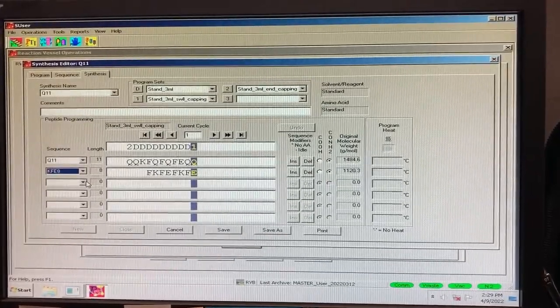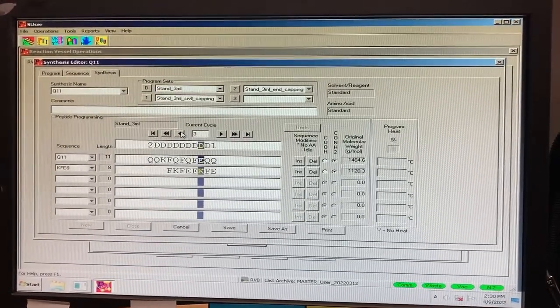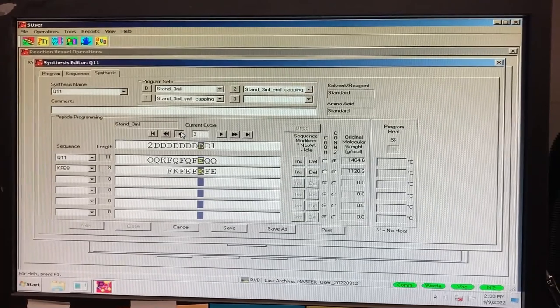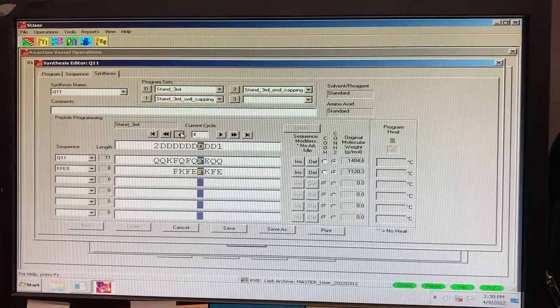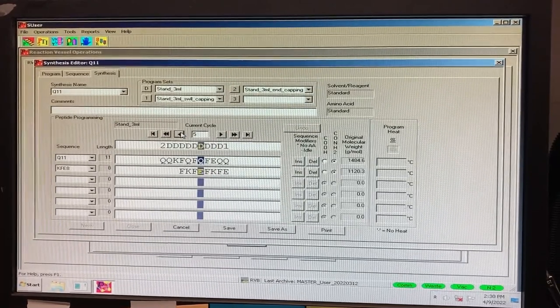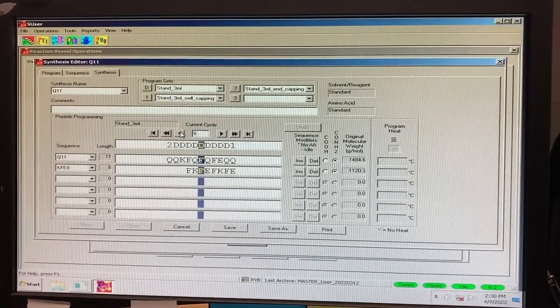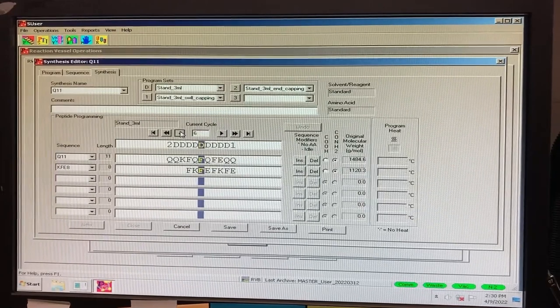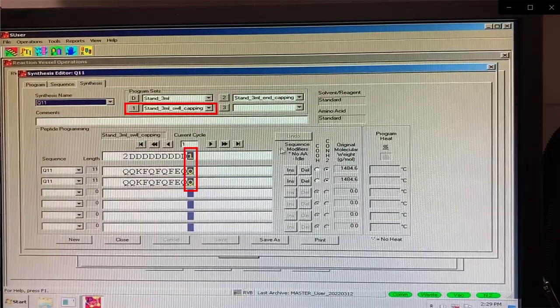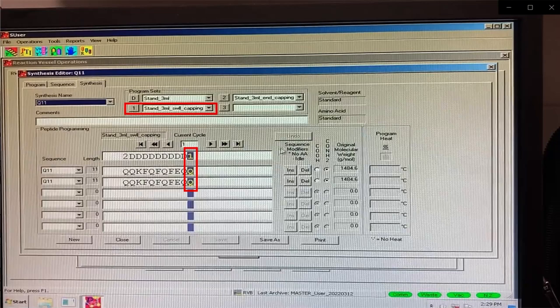Each amino acid will correspond to a letter or number that represents a step in synthesis listed under Program Sets at the top of the window. The step labeled 1 that corresponds to the C terminus of the sequence, for example, is labeled as Standard 3 mL Swell Capping Program.